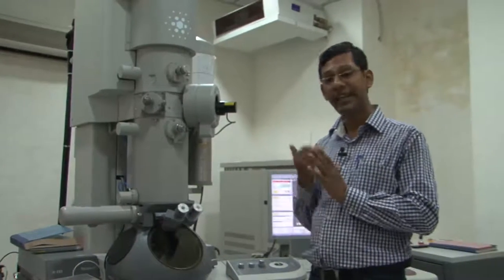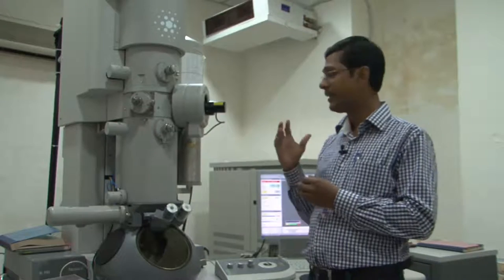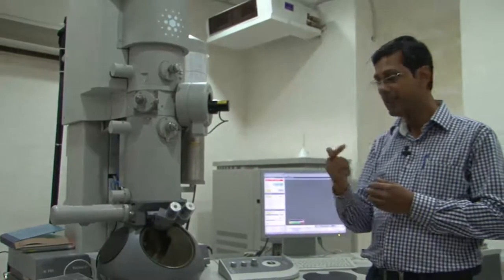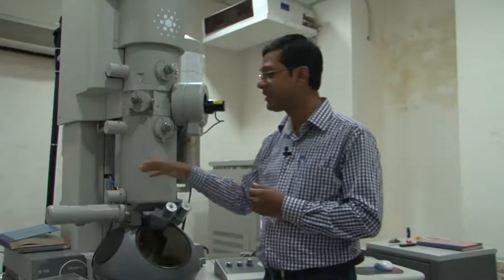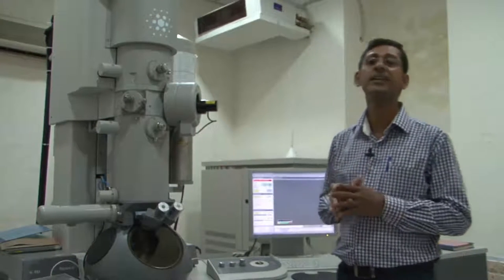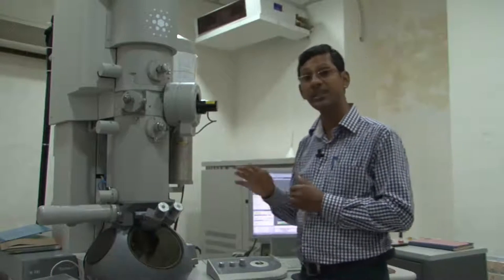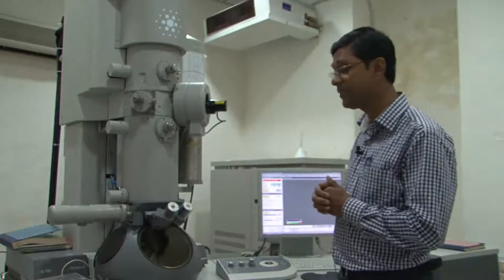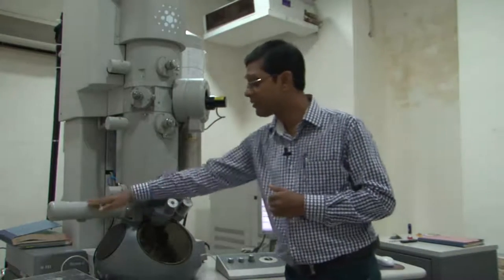So therefore, we can actually get the diffracted beams which are coming from a sample collected by this detector at an annular space, or at an angular space from the transmitted beam. And by using this detector, one can actually see the Z contrast image of the sample. This is just like in a scanning electron microscope, where we use backscatter imaging mode. But here we don't use the same technology or the same concept as in the scanning electron microscope. Rather, we are using diffraction contrast imaging, which is basically governed by the atomic number of the element. So that is attached to this microscope.